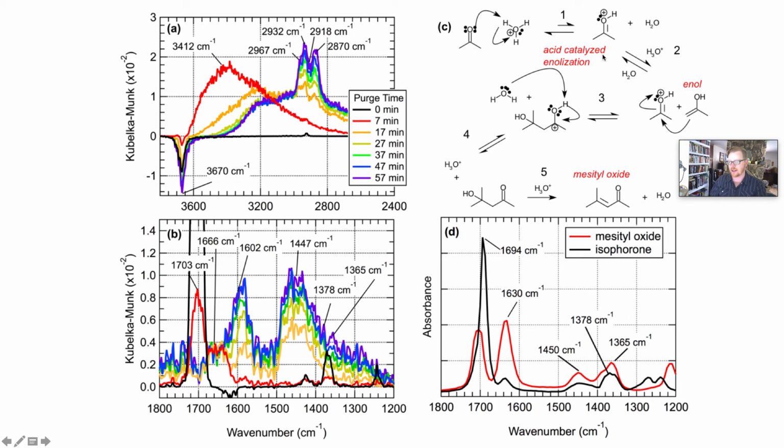This is an aldol condensation, so water is created. So here, this red, that's the water spectrum, right? That has the asymmetric, symmetric stretching. And so it happens early on. I guess I am going through this mechanism after all. So it happens early on in the mechanism, where you make water, and we see that early on in our time.